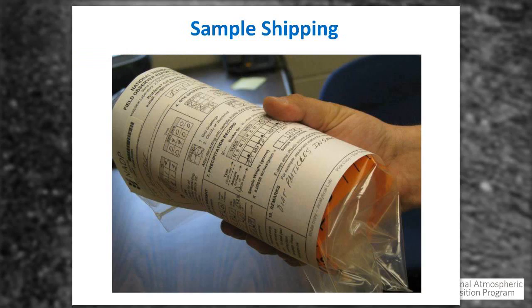Next slide, please. We're going to bypass all the processing of the decanting of the sample, the looking at it. That has been a past webinar, where we give instructions, and like I said, you can view that as well. But as you process your sample, we're going to give you the end result. This is a sample that is ready for shipping.